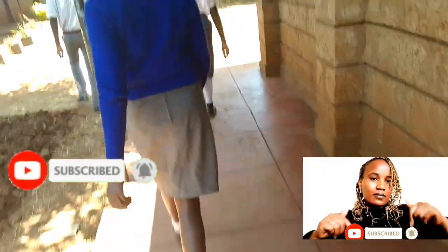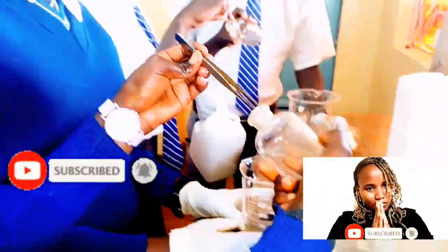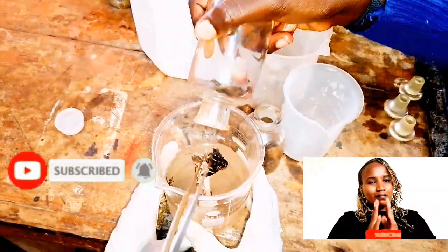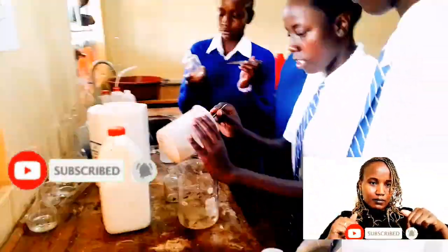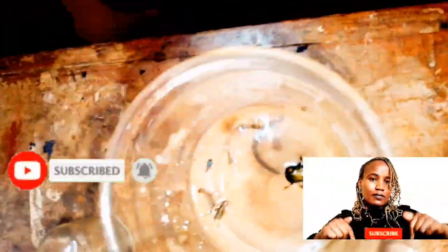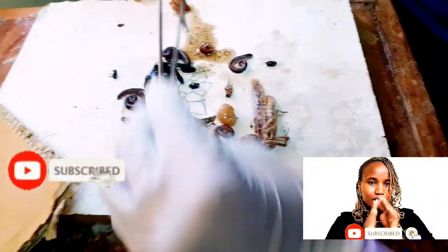Take a look. The first step started by going out there to collect a number of small animals that we shall use in construction of this dichotomous key in this tutorial, and then bring them to the laboratory where we preserved them in a dilute formalin so that they can be used over and over again and make them immobile so that we can be able to look at their external features that will help us in identifying these organisms when it comes to construction of a dichotomous key.